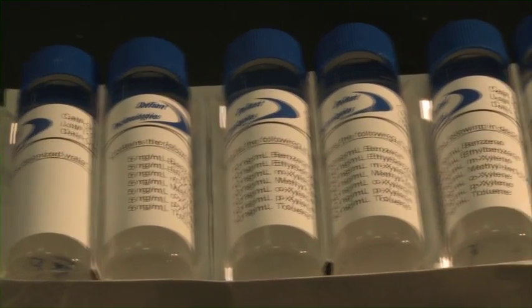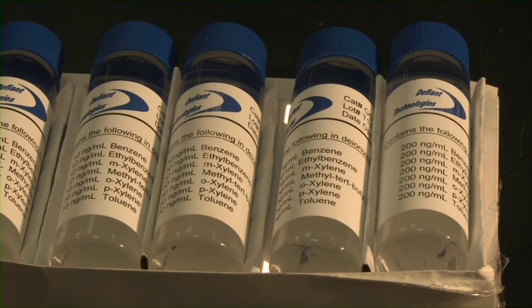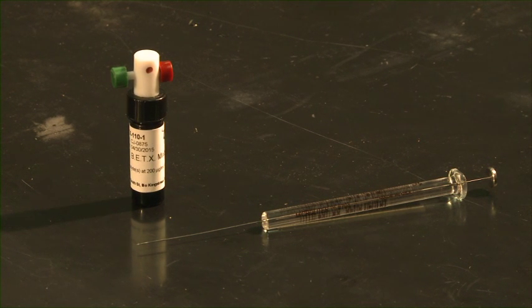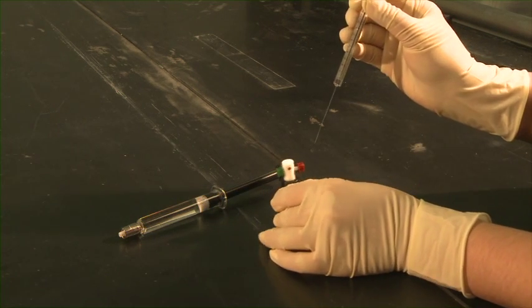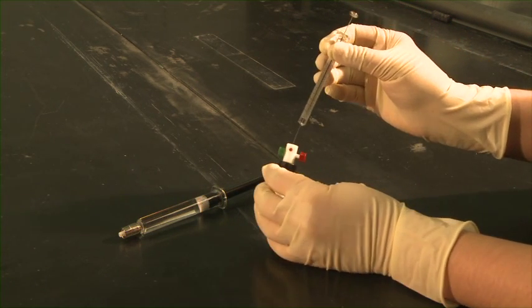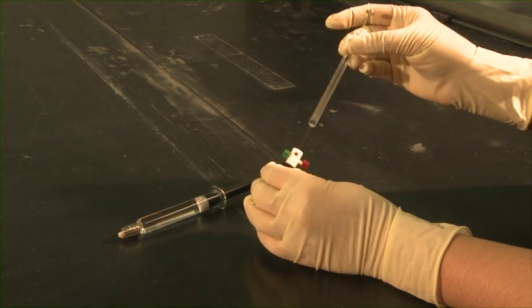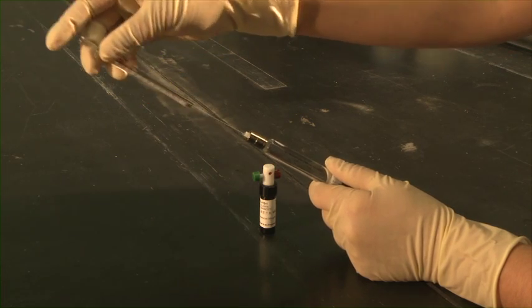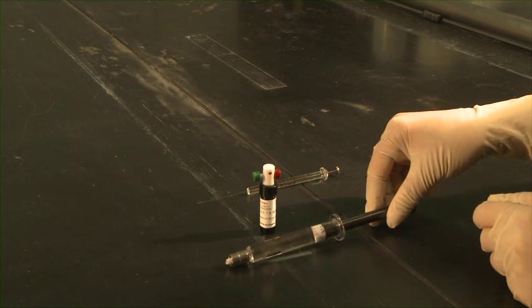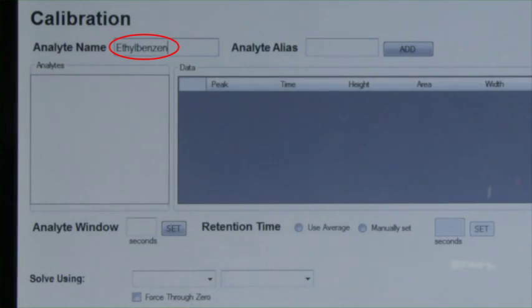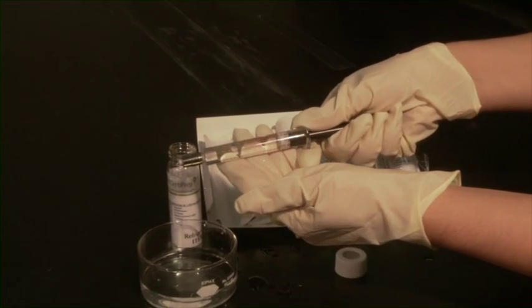A premixed calibration standards kit was used for this demonstration, but the user can also create their own standards. Stock solutions of analytes are available from a number of chemical supply houses. These analyte solutions can be spiked into five milliliters of distilled water and analyzed as previously described. By varying the concentration of the stock solution and the volume of injection, a wide range of calibration standards can be created. In the hands of a skilled operator, an entire calibration sequence can be completed in about 40 minutes.